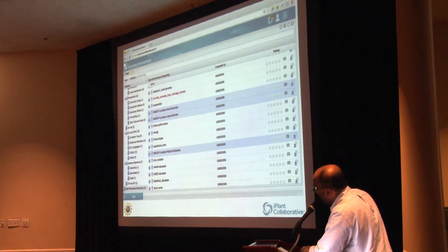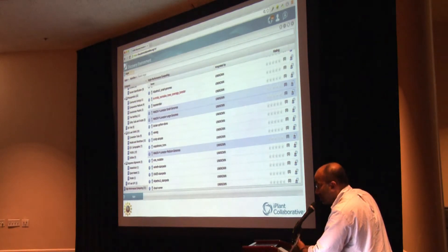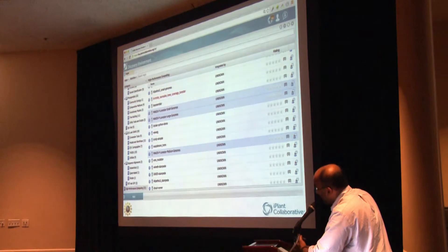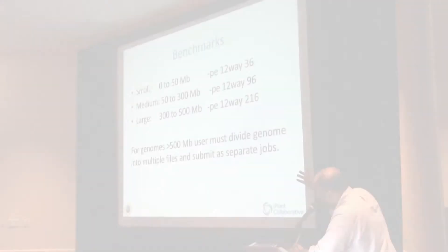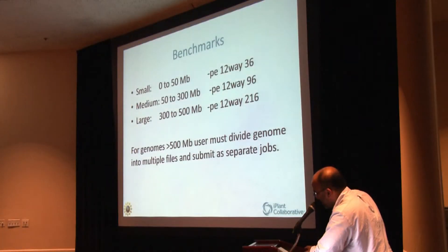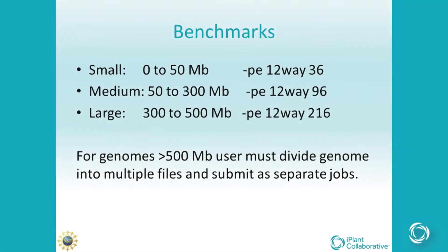One for running annotations on small genomes, one on medium size, and one on large genomes. So these benchmarks are based off of Josh's analysis.